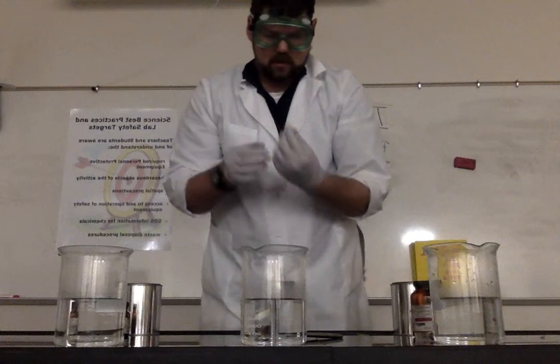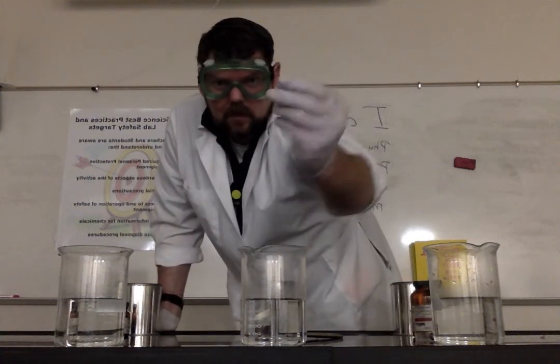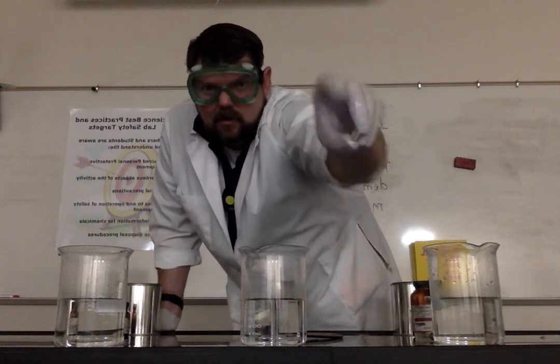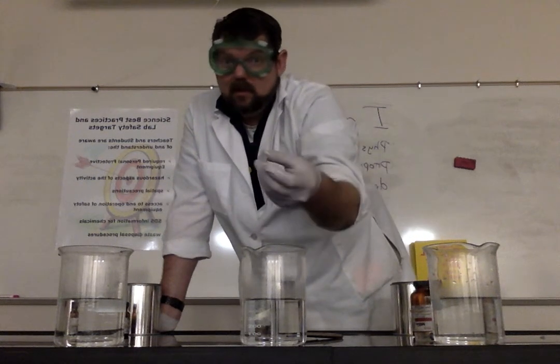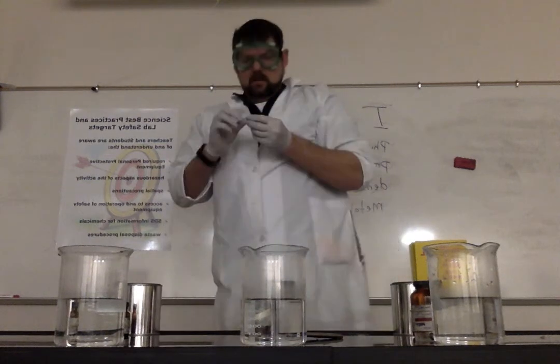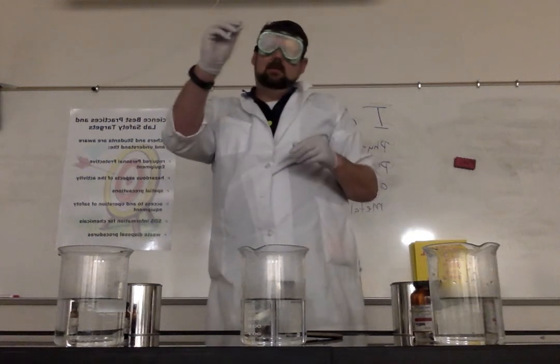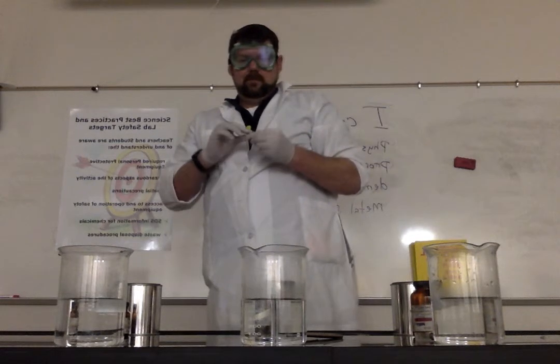Now if we take a look inside, shiny. Let's see, not shiny. Shiny. So again, this looks like a metal, just like the lithium that we cut into. Similarity, because it's in the same family. Now another similarity, it reacts to water. Let's take a look and see what happens. And very malleable. So I'm able to move it into a different shape.